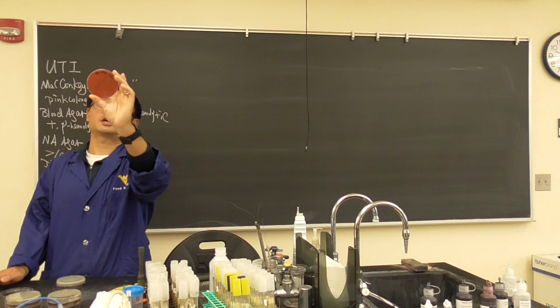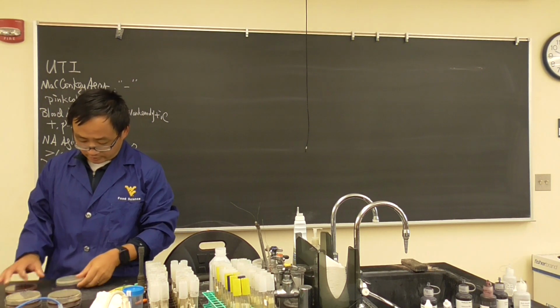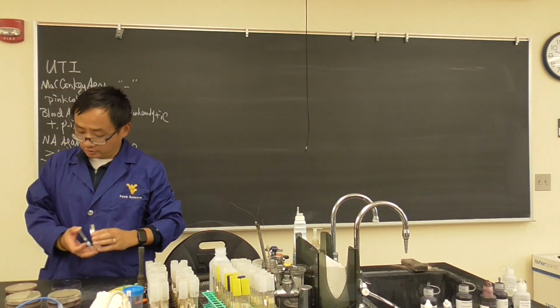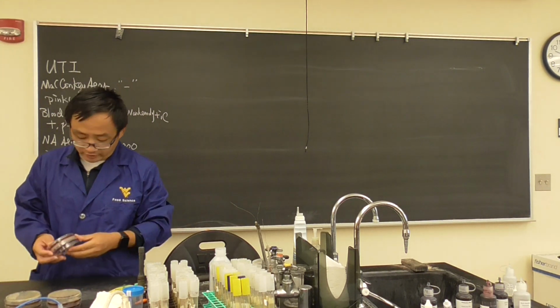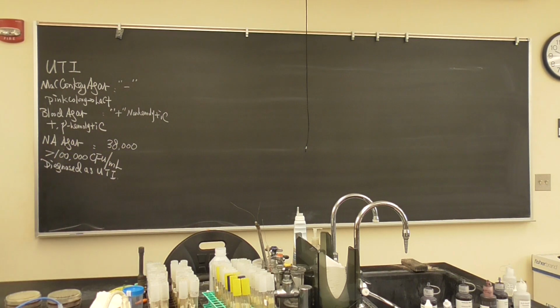But I doubt where this comes from. Maybe it comes from contamination. Because, surprisingly, this nutrient agar has nothing there. So that means the testing could be a sample from the bench or from somewhere. It's a cross-contamination. Otherwise, you would have some growth. So you have 2 out of 3 where we don't have anything. So that's okay. That's not bad. Who else has another plate?